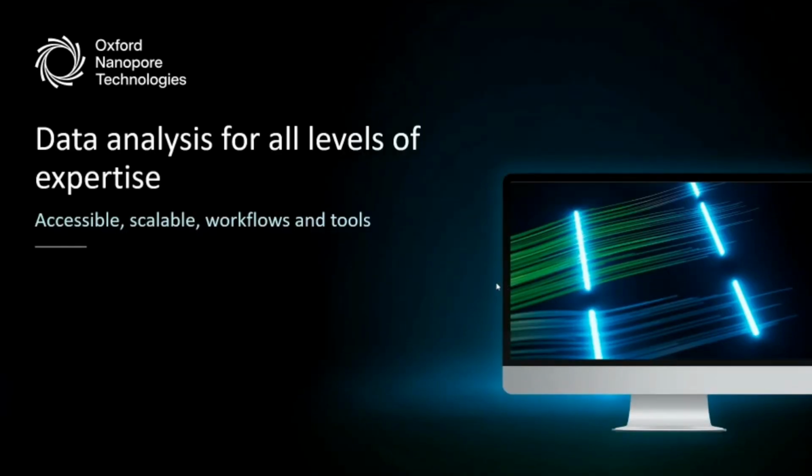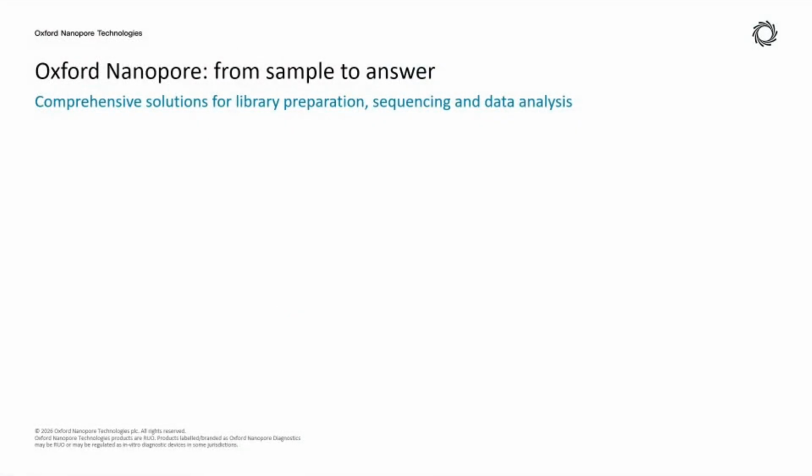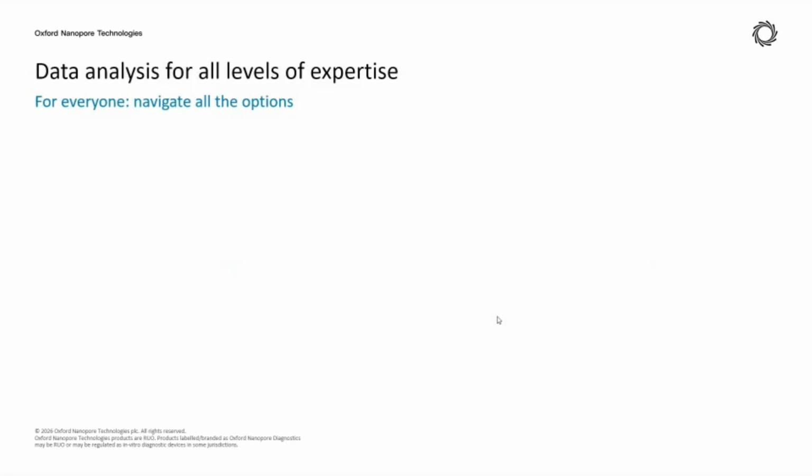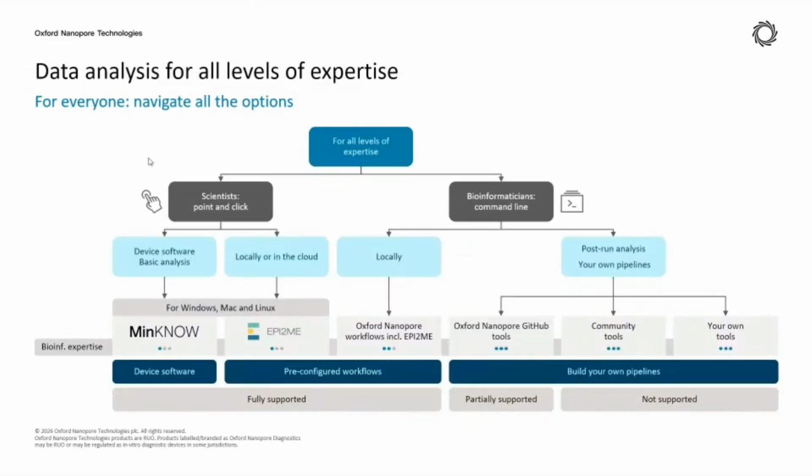So for data analysis, as I mentioned, we do not really need to manually look into each of the variants and compare the tumor and normal to see whether they are somatic. There are already analysis solutions prepared and designed. ONT provides data analysis and data handling solutions for all users. Here we are looking at two different software: one is called the MinKNOW software, another one is called the EPI2ME software.